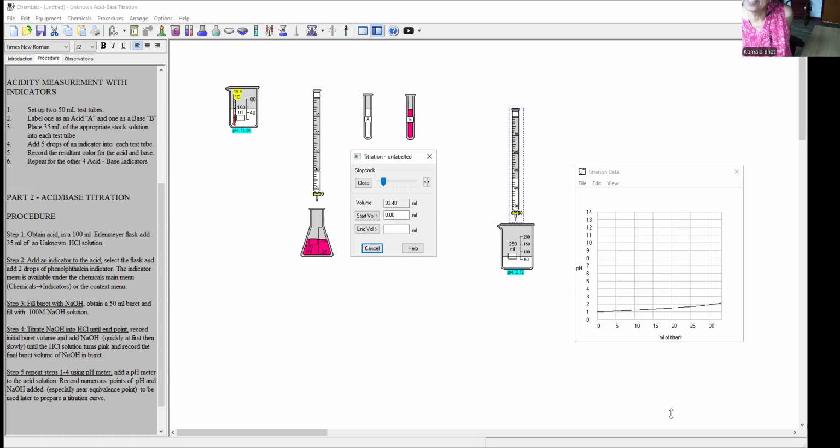So we'll have to wait till the neutralization point is reached. One of the mistakes a student makes is that as soon as the neutralization point is reached and you see a sharp curve, you stop the reaction. Don't stop. Let the burette drain out so that you get two halves of the S shape clearly indicated, so that now you can see how quickly the pH is changing. And now you can also view the end of the pH titration.